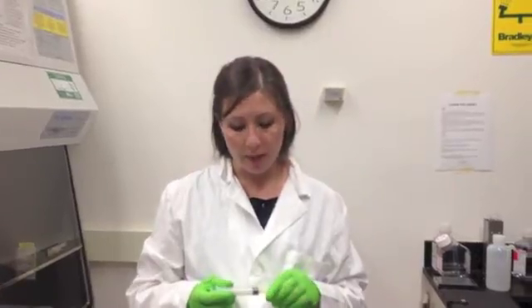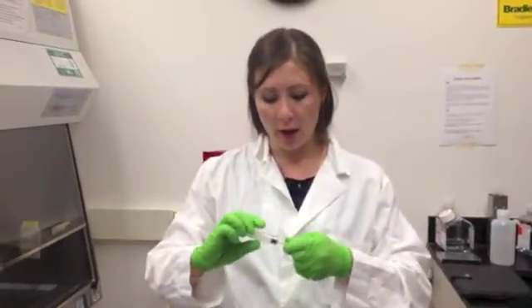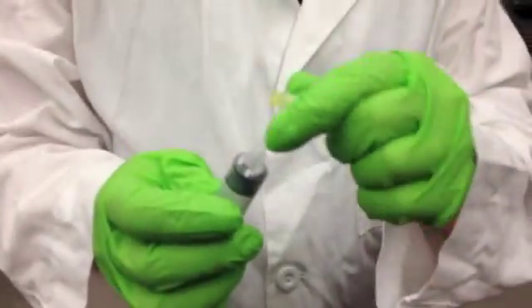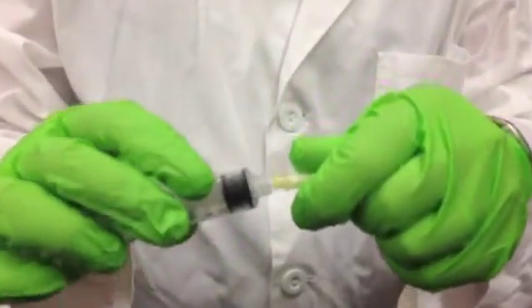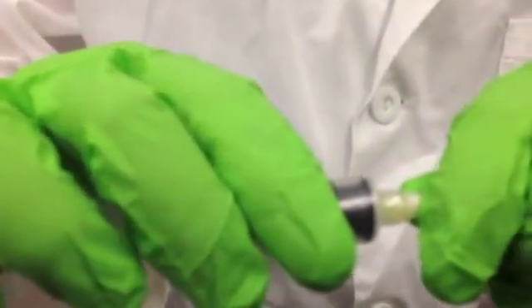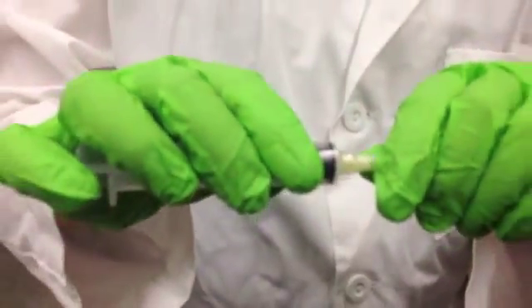Talking about sharps, your basic safe sharps design is called a luer lock. You can see that there's a thread at the base of this syringe, and the needle will actually thread right onto that. And that prevents the needle from popping off, which can be a problem.